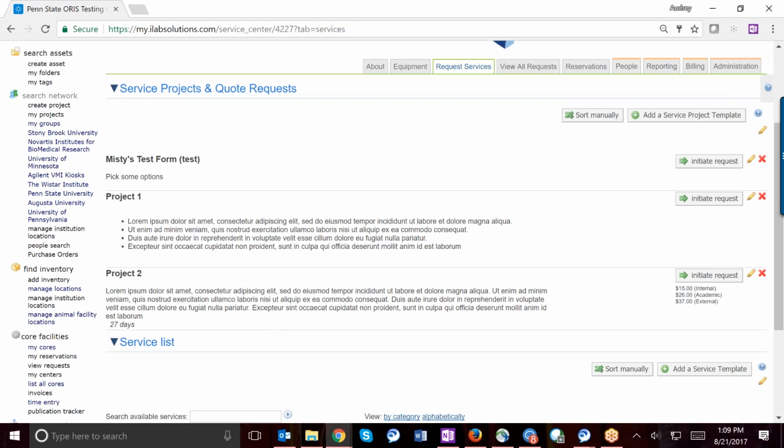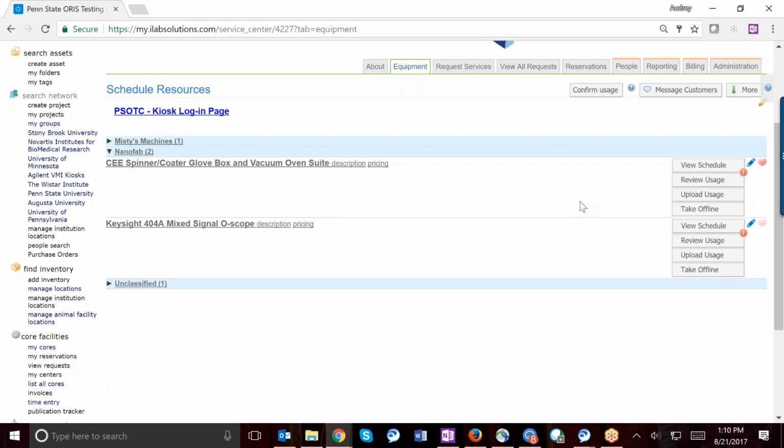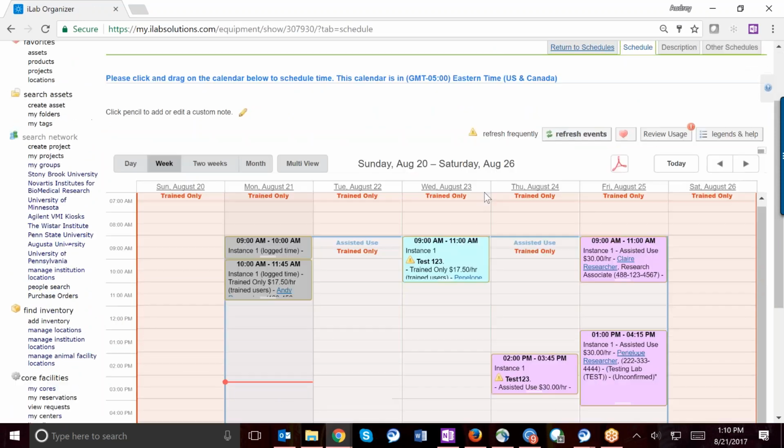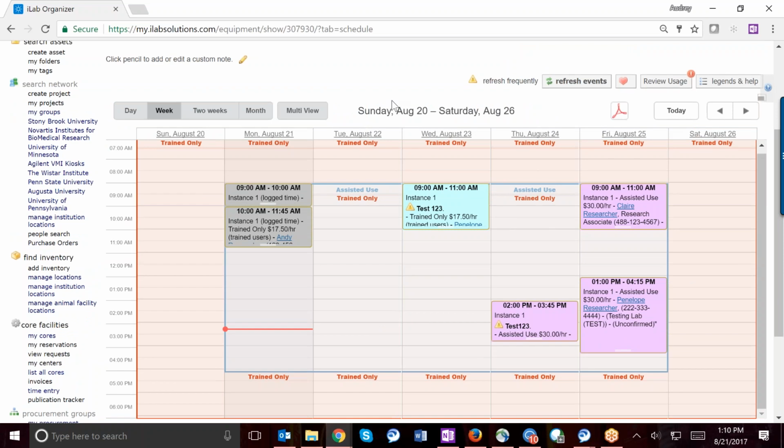Yeah, very quick. It says put offline until. Can we also schedule something, like I want to take it offline tomorrow until the day after? Or the take offline button? Sure. So if you wanted, let's go back into that calendar. There is that unavailable event type option. Okay, but the take offline is only from right now until... Correct. The take offline is only from this moment until either that day and time that you set it, or until you manually put it back online.